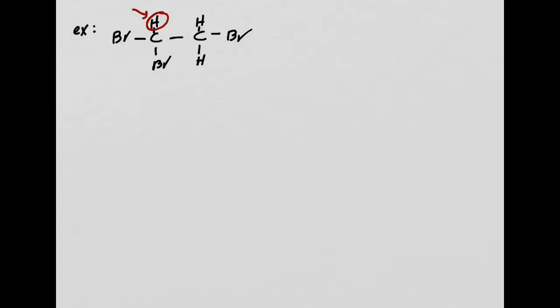All right. I'm going to look at the adjacent carbon. So this hydrogen is attached to this carbon, and we're looking at this one to see what kind of peak we're going to expect. There's one adjacent carbon and it has two hydrogens, A and B. And then this other one has no hydrogen.